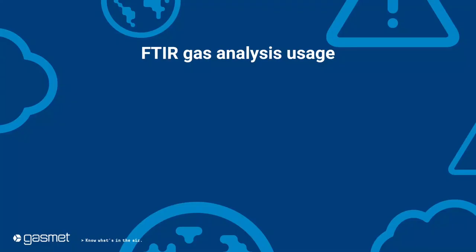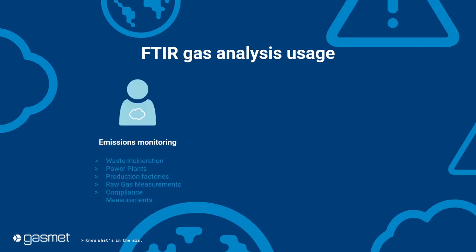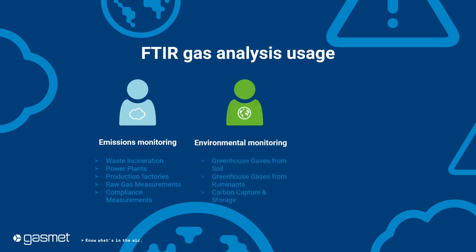So, that's how it works. Now, how is this used? FTIR gas analysis has many different uses, and here are some examples. First off, emissions monitoring. Power plants, factories and such are required by law to monitor their emissions to prove that they don't pollute over legal limits. Next, environmental monitoring. FTIR gas analysis can be used in greenhouse gas research, for example. And safety monitoring. With gas analysis, we can, for example, check shipping containers for toxic gases and keep people safe.